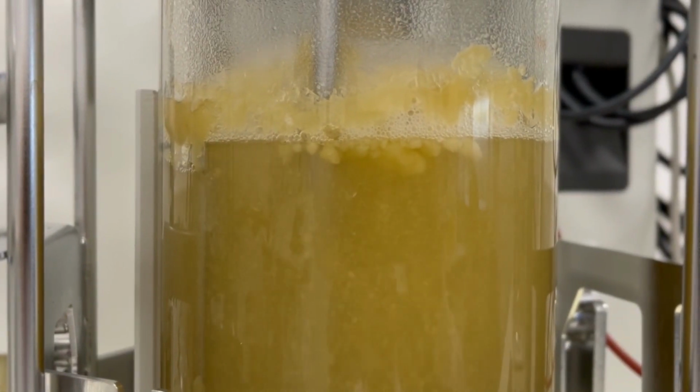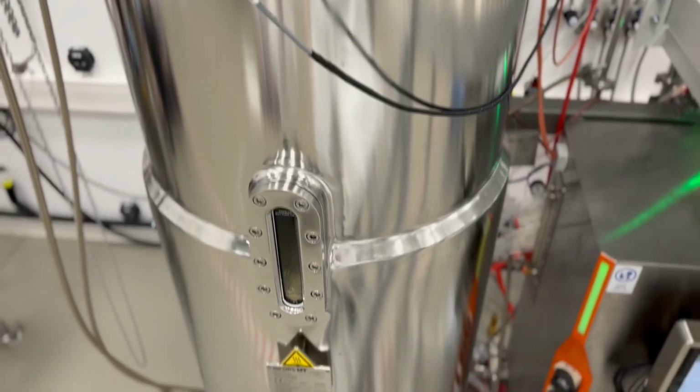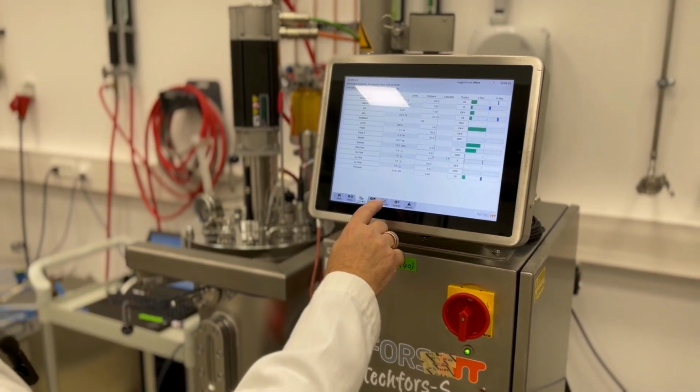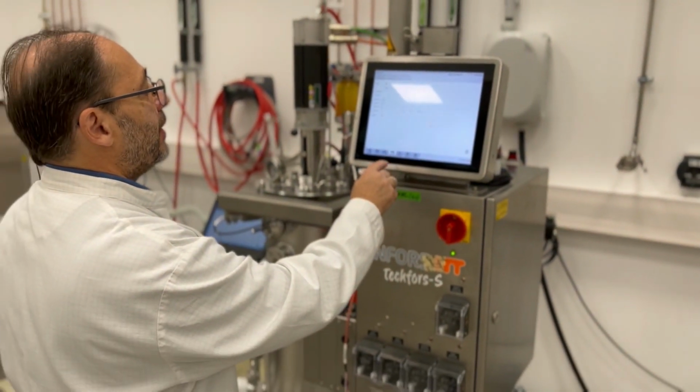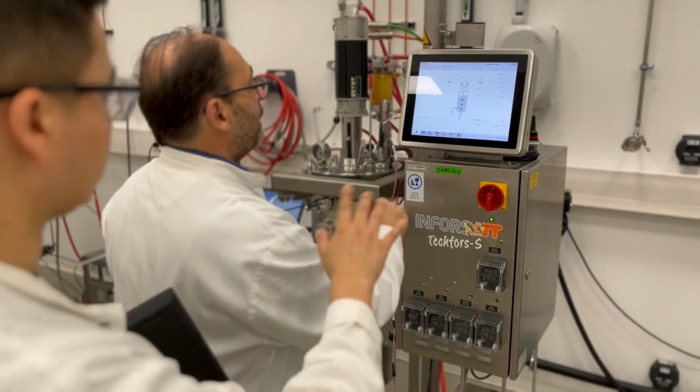Modern industrial biotechnology makes use of microorganisms for the production of a variety of different bioproducts. These bioproducts can be generated in large amounts in stirred tanks or bioreactors, where a controlled environment is provided. The scale of these bioreactors can be moved up in order to create large amounts of such compounds.